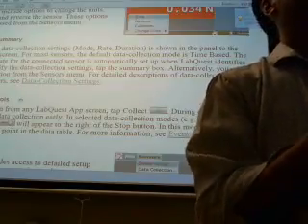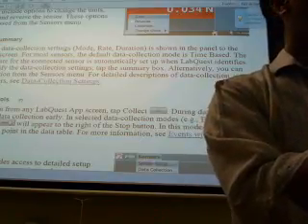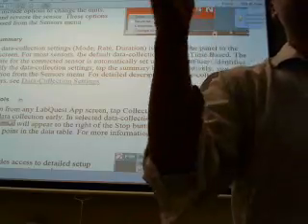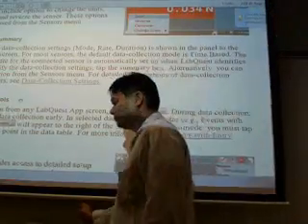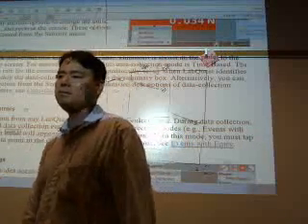Okay, this is what you're going to find. This one automatically allows you to determine samples per second or the interval. It's the same thing. Do you know it's the same thing? It depends on what's easier to do.